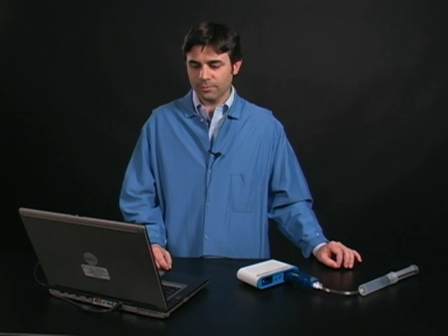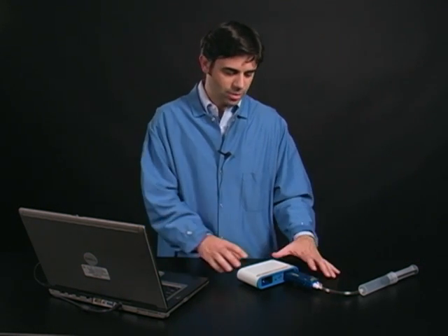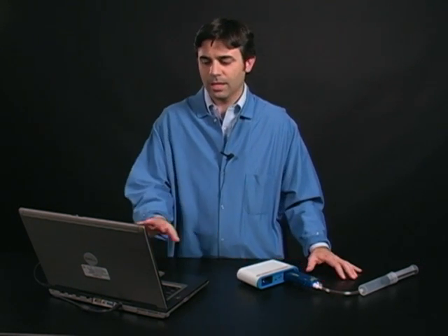So now you can see that the Odyssey software and the PASCO SparkView software complement each other very well. With PASCO's equipment, software, and analysis tools we can understand chemistry from a macroscopic perspective. But to get a deeper understanding, we need a molecular perspective. And that's where the Odyssey software comes in. Thank you very much. This has been Tom Loschiavo. Feel free to reach me at chemistry at PASCO.com.